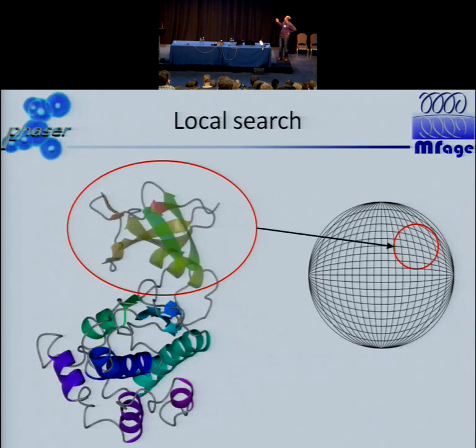So it localizes the molecular replacement to just a small volume around the position that is coming out from this known assembly. So why does this help? It's actually not faster, surprisingly. But in case you have some large noise peak somewhere else, then these will not disturb your structure solution, and you are more likely to find the correct solution.